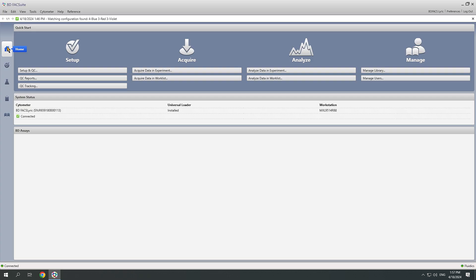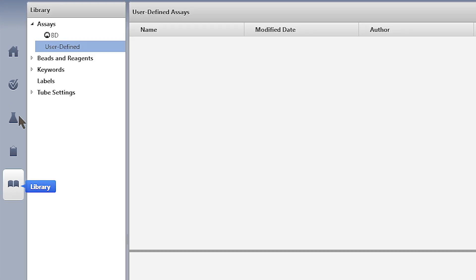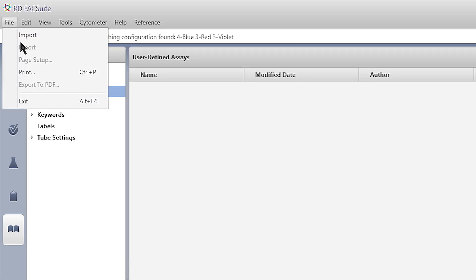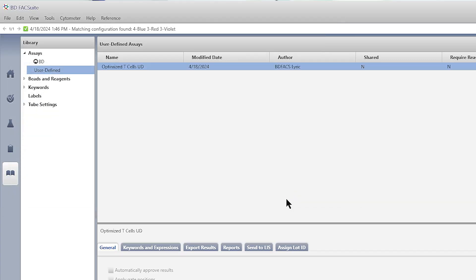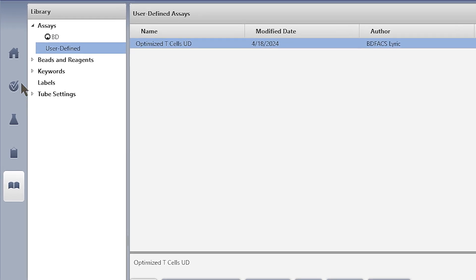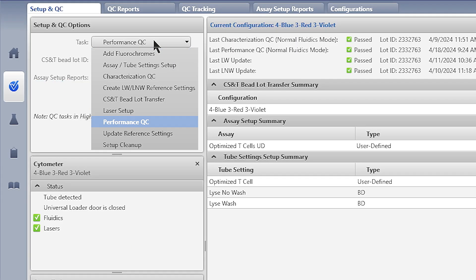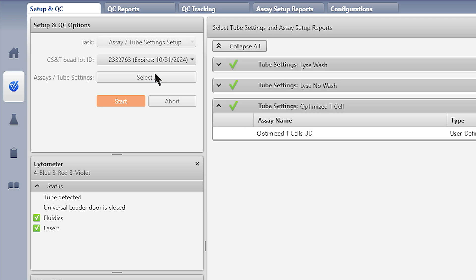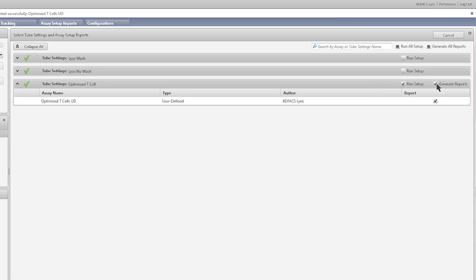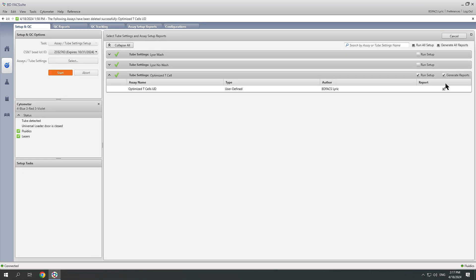Now I can start running the optimized T-cell assay immediately. I'm going to import the assay in the FaxSuite library. Now I'm going to run CSNTBs to normalize any differences between cytometers or CSNTB lots. I want to make sure that I select the T-cell assay for this task.